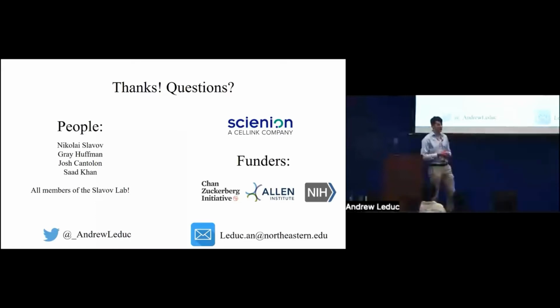Extracting as much protein as possible, there's always room for improvement. But to the extent that these methods have been benchmarked against other more common lysis methods such as urea or other chaotropic agents, there are trade-offs with every approach to measuring overall protein abundance, but this seems to be an accessible one that we find a good approach for getting a rough idea, at least in some sense.